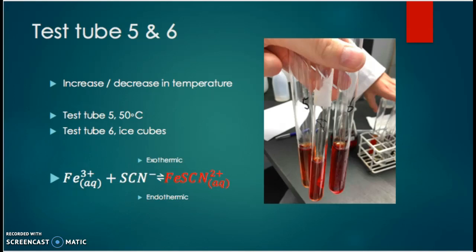If we decrease the temperature, as we did in test tube six, the opposite happens. For the equilibrium to be reestablished, the forward reaction forming products has to occur, which is why test tube six shows a darker red — it has a higher concentration of products. Test tube five is lighter, then we have seven as a reference showing the original color, and then test tube six.